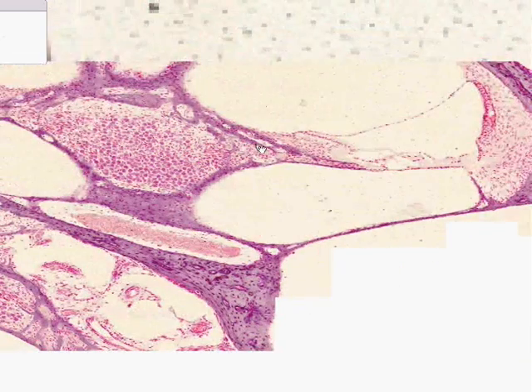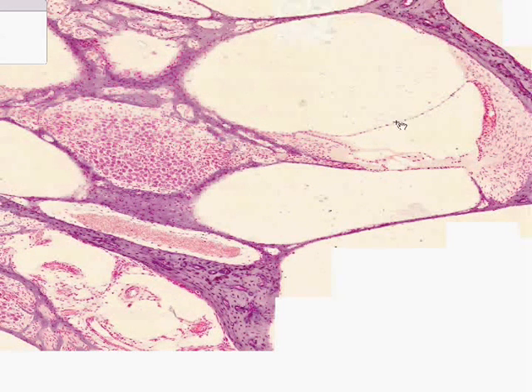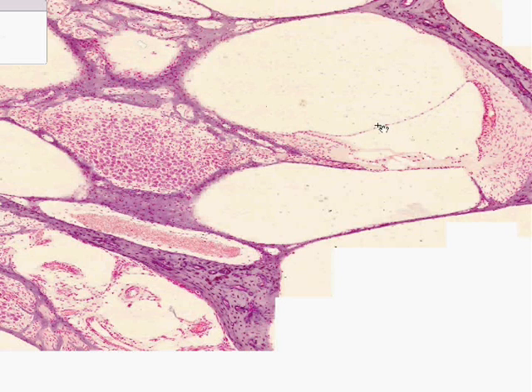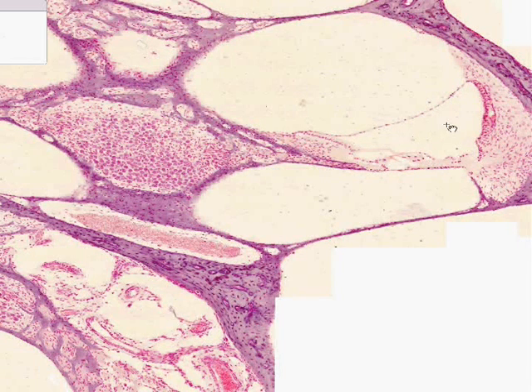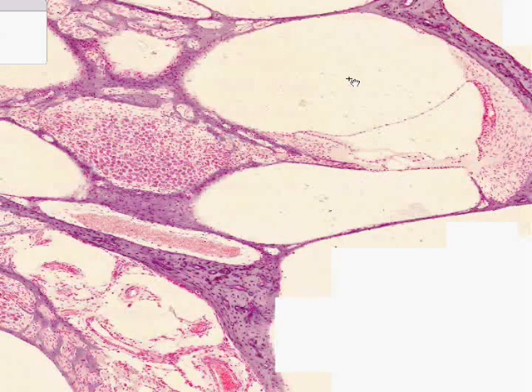You will also see another cavity, a smaller one on this side of the vestibular membrane. You'll see a larger cavity on this side of the vestibular membrane. You will then see a tectorial membrane over here and a basilar membrane over here, and then another chamber.